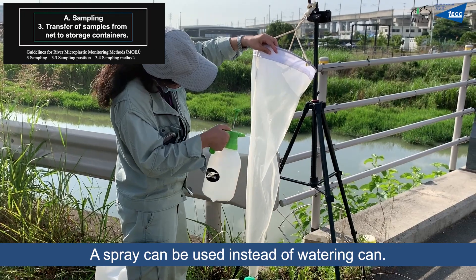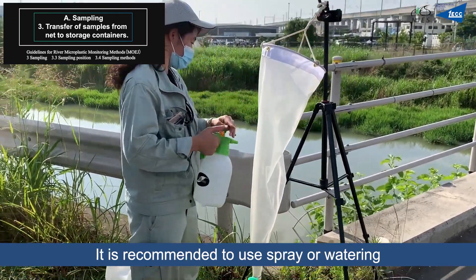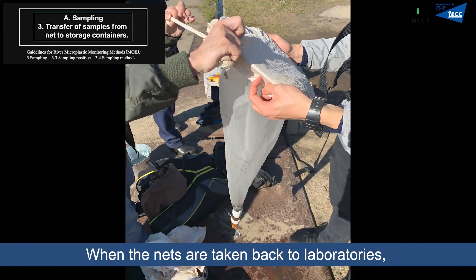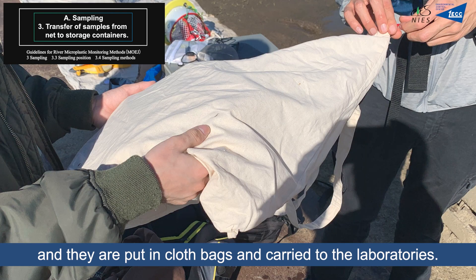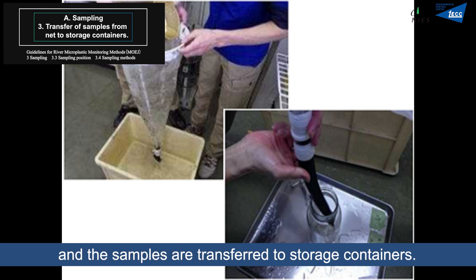A spray bottle can be used instead of a watering can. It is recommended to use spray bottles or watering cans not made of plastic to avoid contamination. When the nets are taken back to laboratories, their mouths are covered with cloths, placed in cloth bags, and carried to the laboratory. In the laboratory, the nets are washed with tap water and the samples are transferred to storage containers.